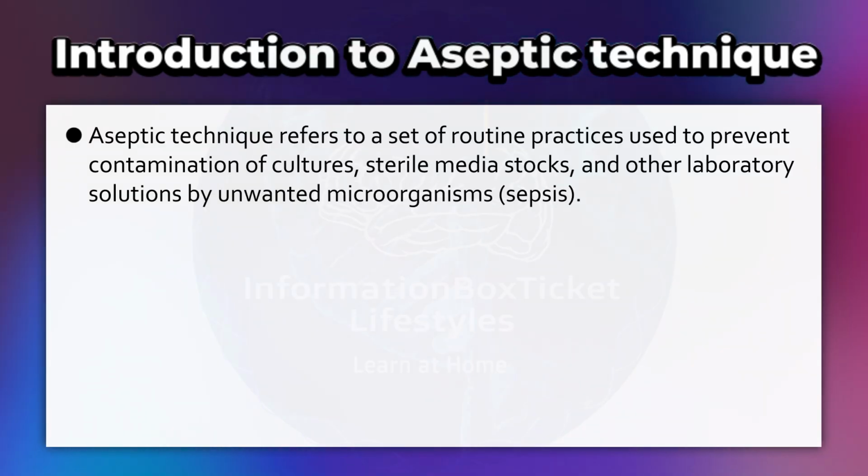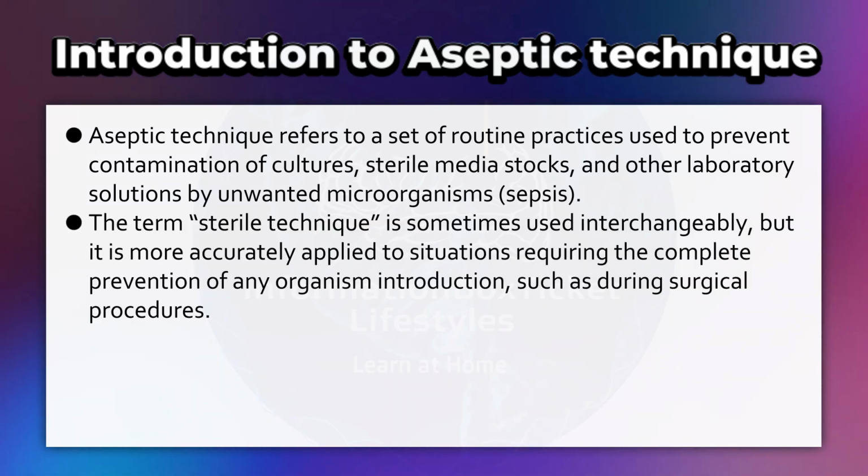Aseptic technique refers to a set of routine practices used to prevent contamination of cultures, sterile media stocks, and other laboratory solutions by unwanted microorganisms, sepsis. The term sterile technique is sometimes used interchangeably, but it is more accurately applied to situations requiring the complete prevention of any organism introduction, such as during surgical procedures.